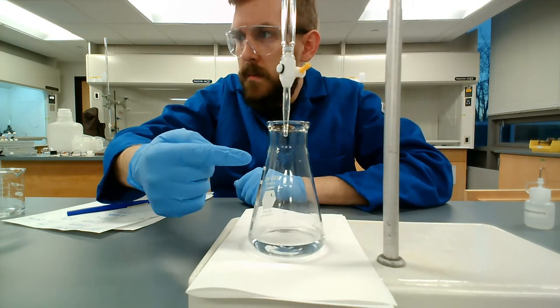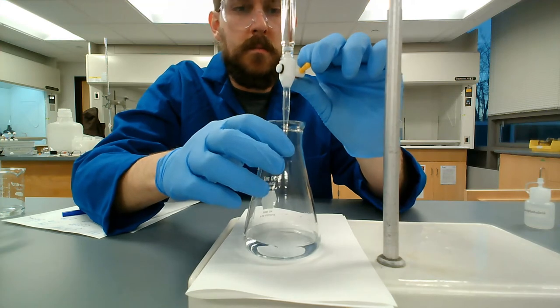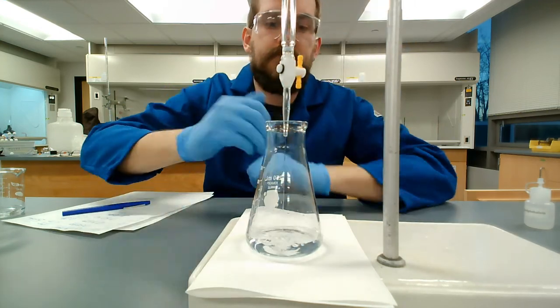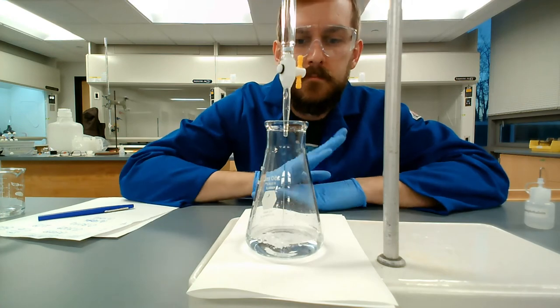But you still want the tip of the burette a bit into the Erlenmeyer flask, just to prevent, when you're swirling, from you ever just missing and having some sodium hydroxide go on the outside. Right. So again, wide open at the start. Let this go for a bit.